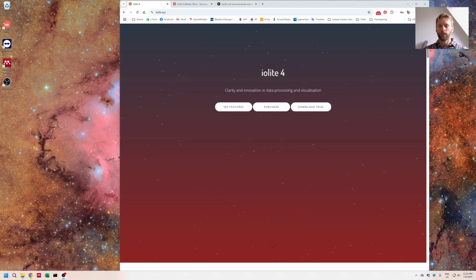Hi everybody. So today we'll be learning how to use Iolite 4. Iolite 4 is the program that we use to reduce data from the laser ICP-MS.